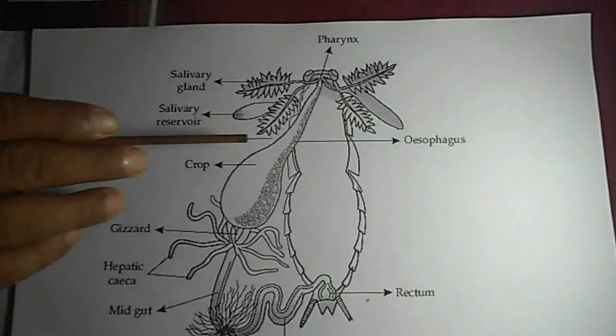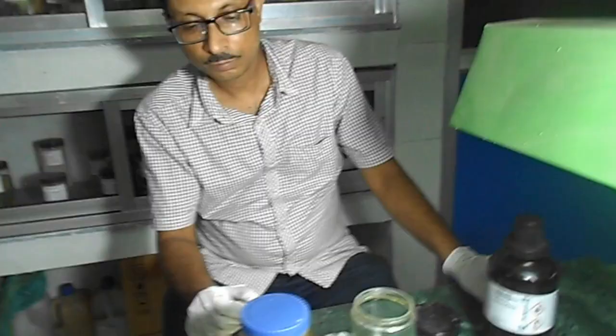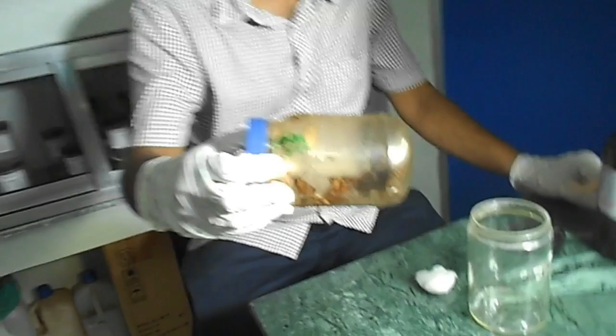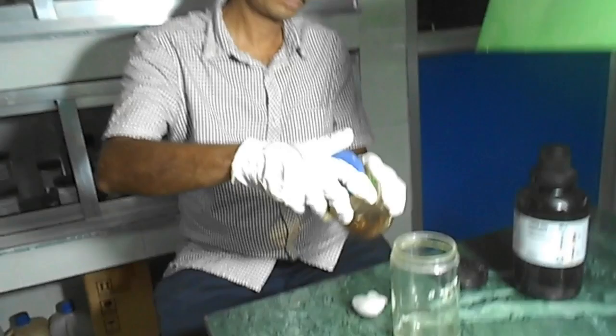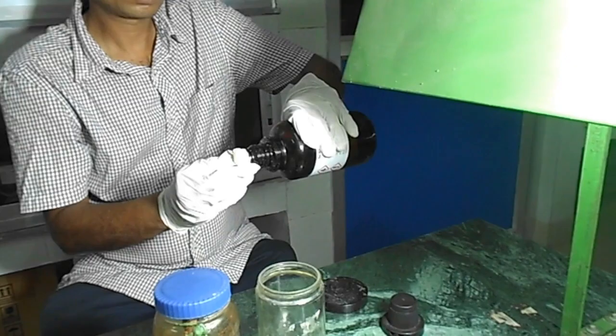Now let's start and see the dissecting part of the digestive system of cockroach. First of all, we have to kill the cockroach. In our lab, before dissection, we collect cockroaches from storehouses, godowns, and kitchens. My friend demonstrates how we kill cockroaches in our lab. First of all, he soaks a cotton ball with chloroform and places this chloroform cotton ball in a plastic jar.